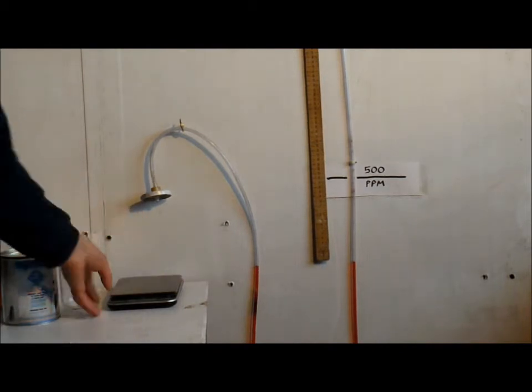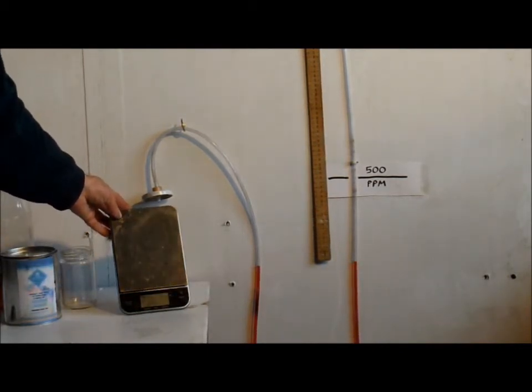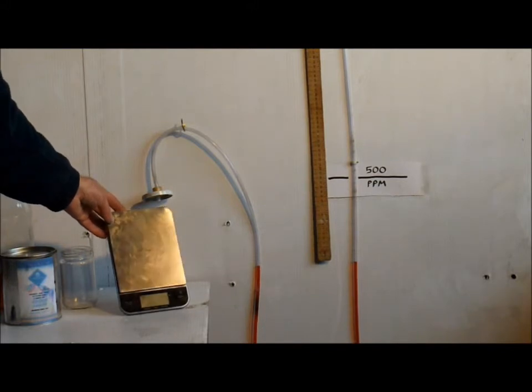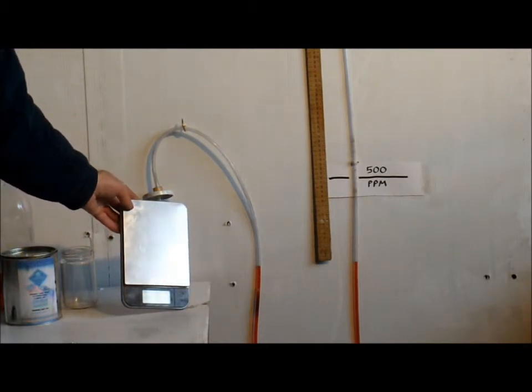The first part of a carbide manometer is an ordinary kitchen scales. It only has to be accurate to one gram, so an ordinary kitchen scales is fine. These can be bought in Lidl and other stores for around 10 euros.